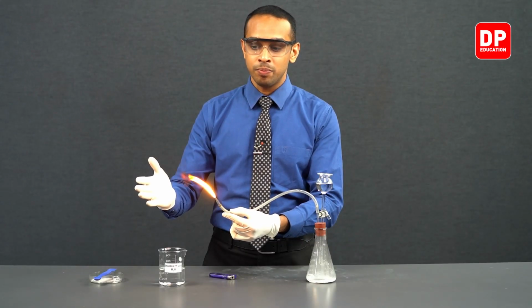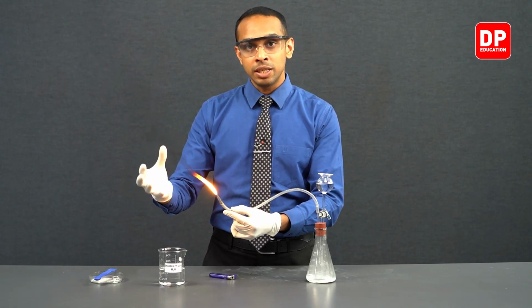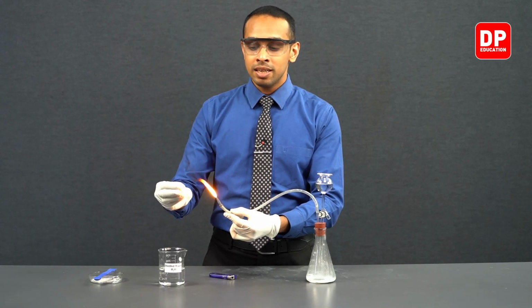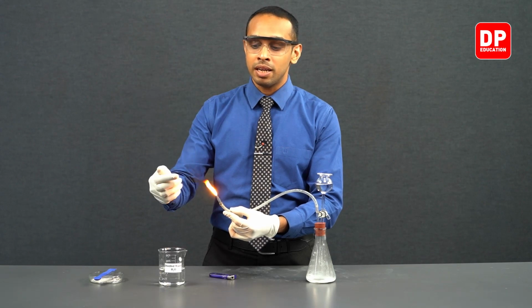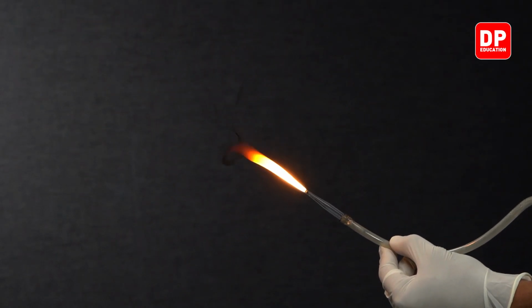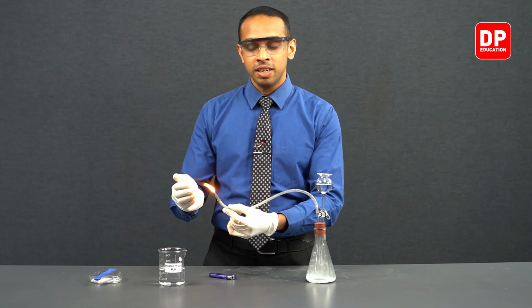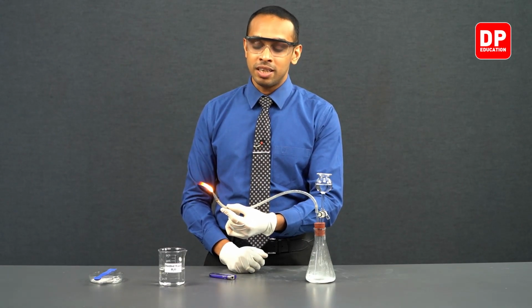Therefore, when you are burning acetylene in air, due to incomplete combustion of this particular gas, there's going to be quite a bit of unburnt carbon, which results in a sooty flame that you observe here. Alright students, now you have observed the sooty flame that is produced from the acetylene gas.